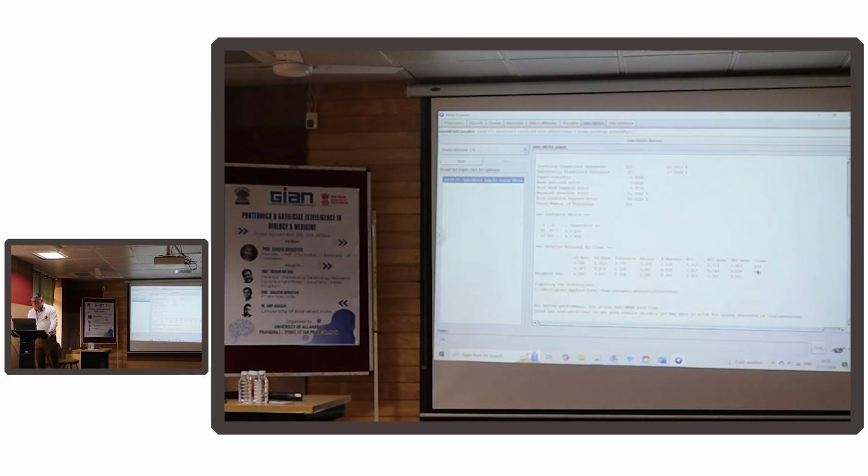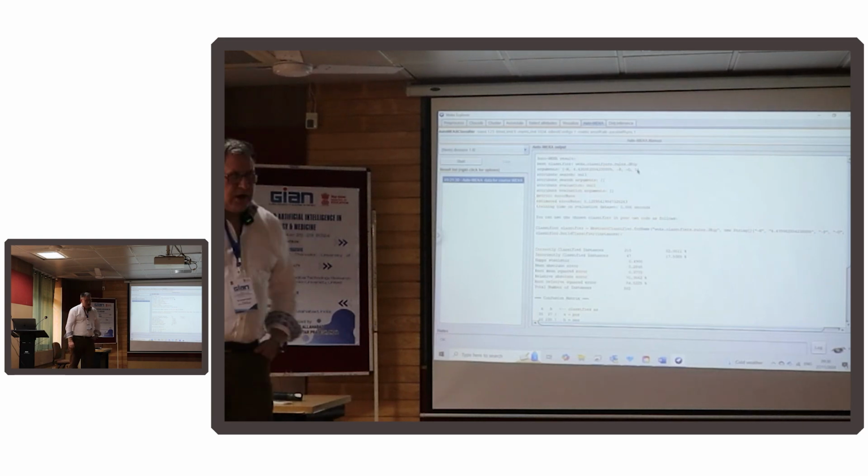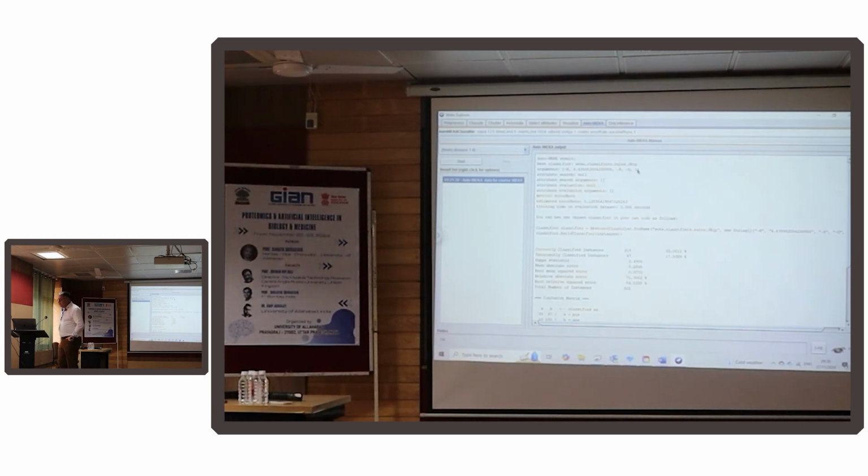Okay, our Weka Explorer has finished. It's run for 5 minutes. The ROC area for this combination, so what did it find? Well, let's have a look. It found that in this case the best classifier was a rule-based classifier called JRip. It's got the parameters for that classifier here, and the error rate here.